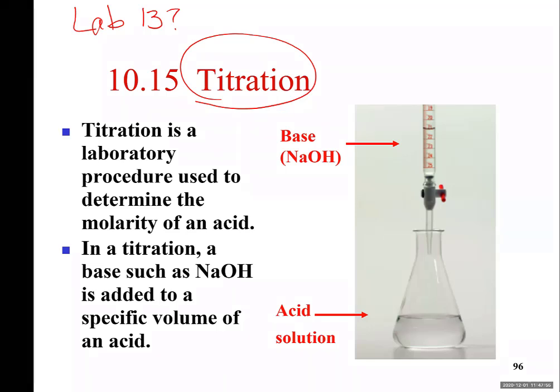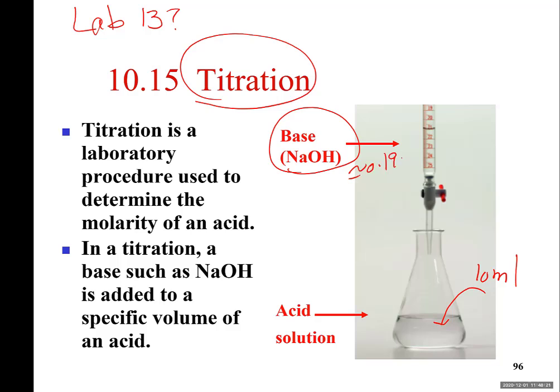So guys, that's what you are doing for lab 13. Inside this flask, you are placing 10 ml of vinegar. It's diluted vinegar. And then inside the burette, you have sodium hydroxide with a known concentration, around 0.19 something.